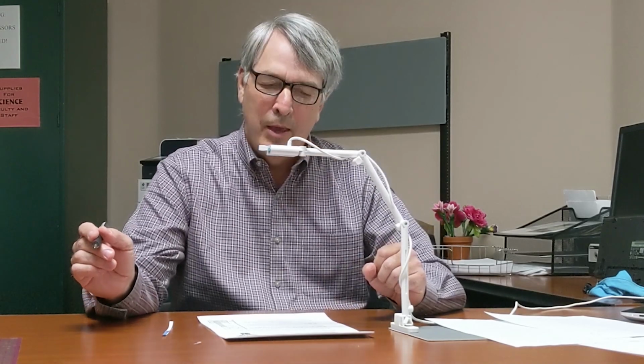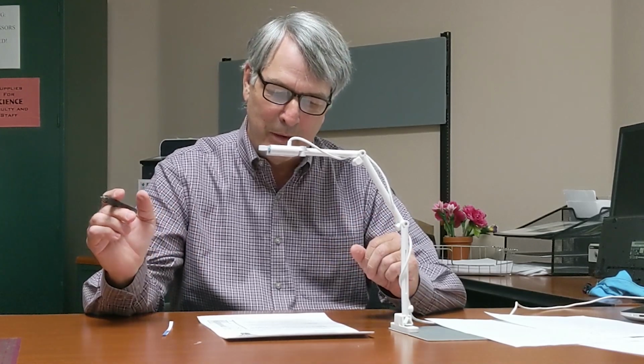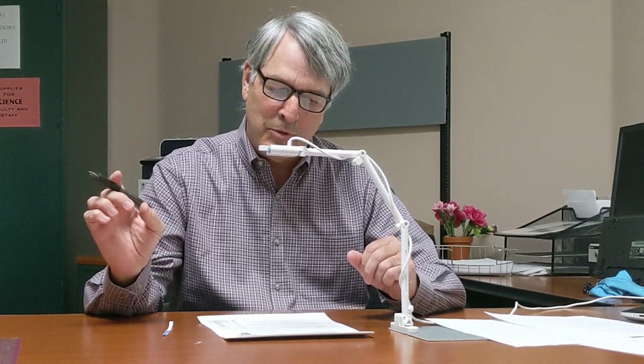My name is Tom Gill, and I'm going to be talking about experiment 12, and then we're going to go in the lab and actually run the experiment. So this experiment is a very simple way to find the value of the ideal gas law constant, and that's what we're going to be focusing on doing today.